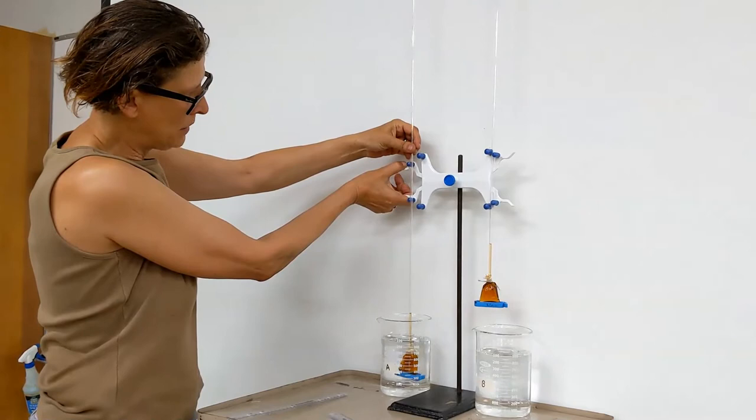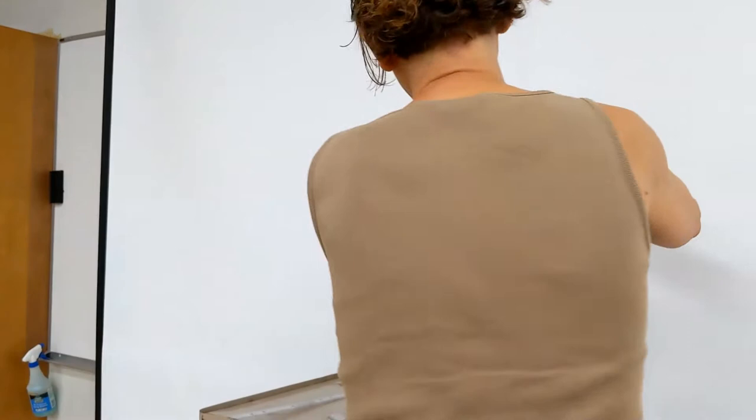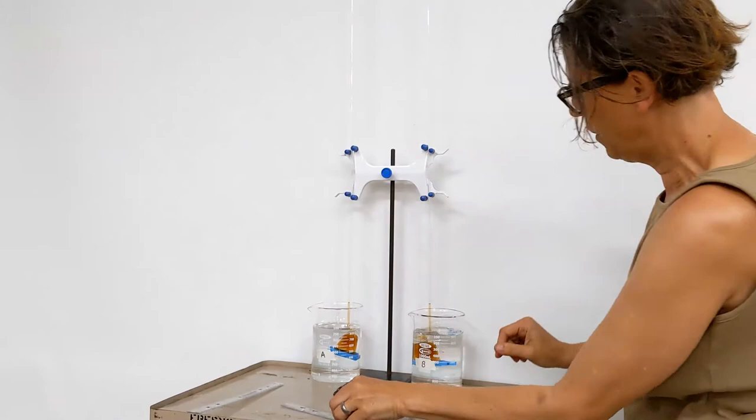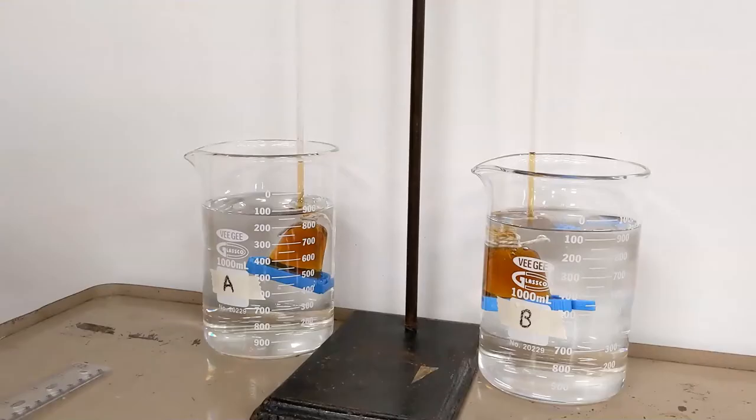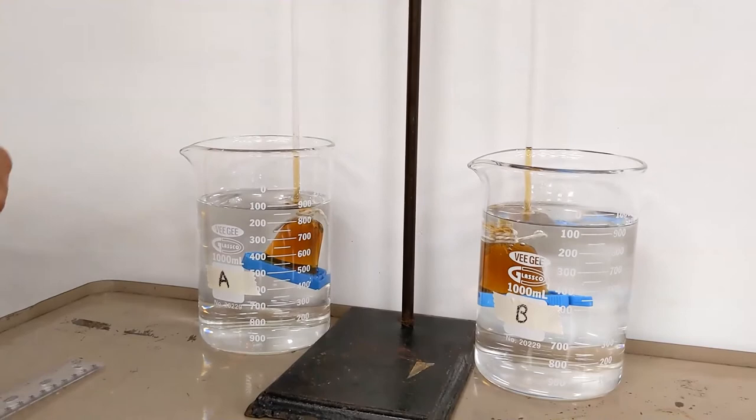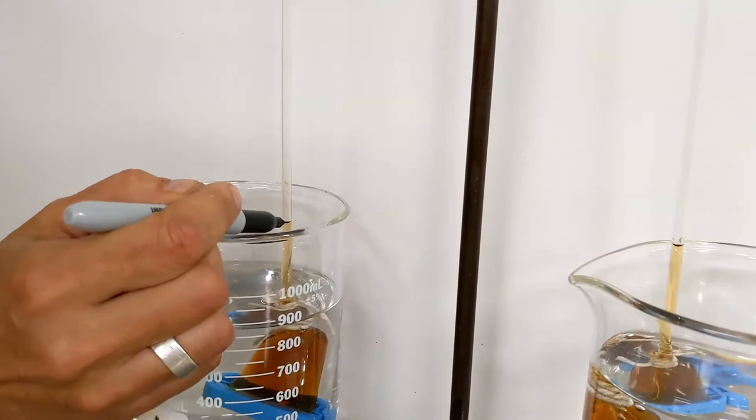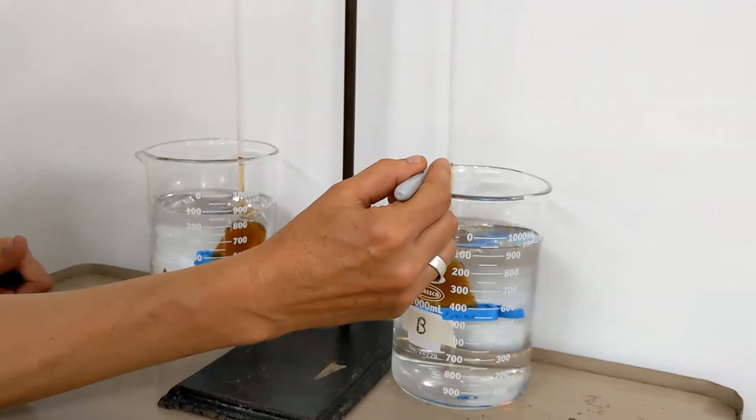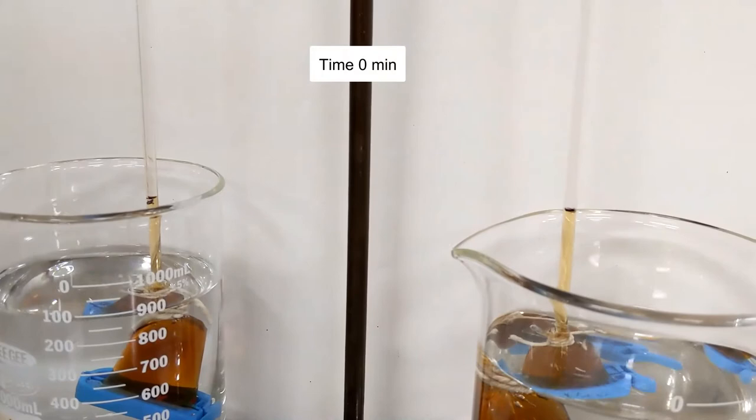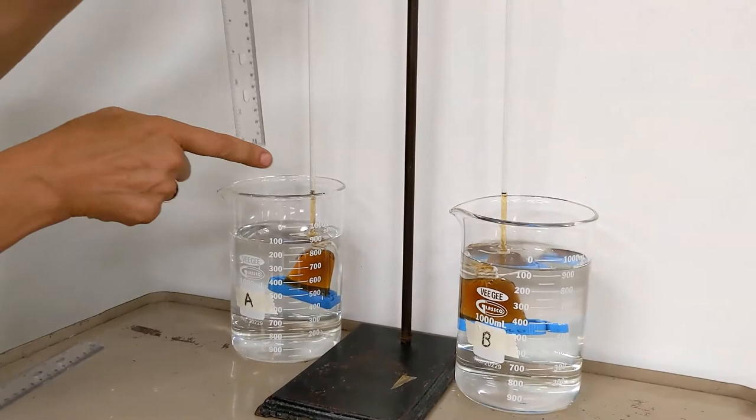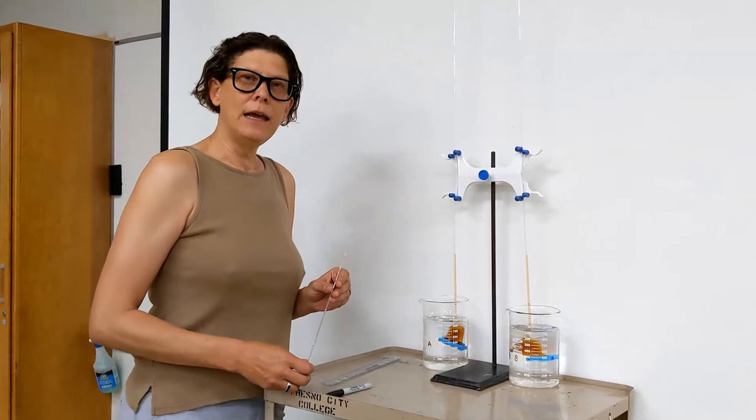Let's drop our dialysis tubings into beaker A and beaker B. We want to note the original starting point. We will now initial our beginning point. Add the meniscus, and then over time we'll be using a ruler metric system to measure how far each has traveled.